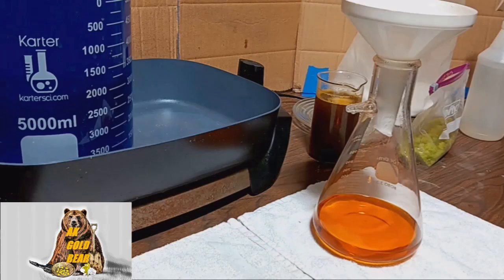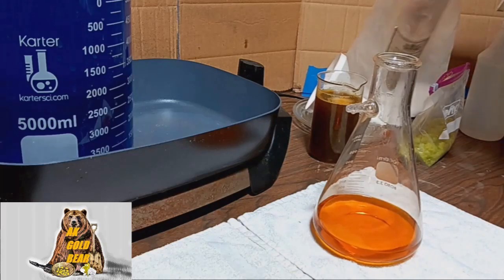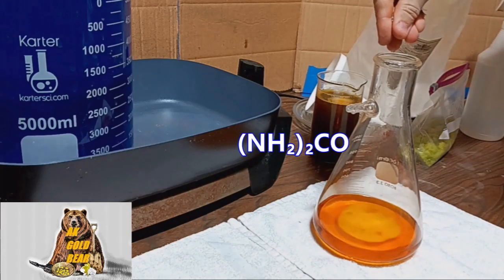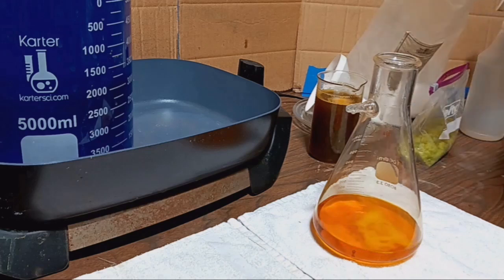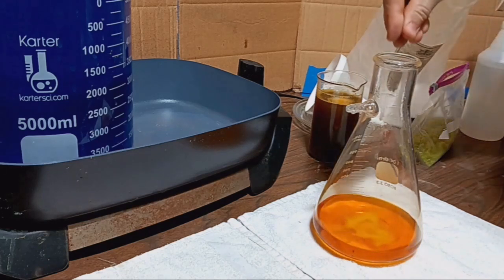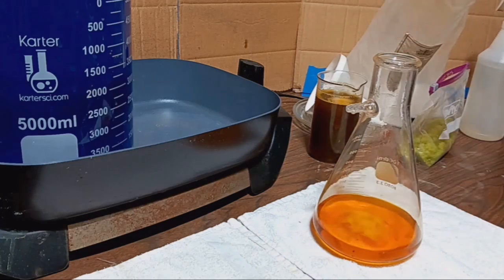I have some chlorides — probably lead chlorides or maybe tin chlorides. Filtration is over. The solution looks very good, crystal clear. A little bit of urea to neutralize the nitric acid. I think it's enough.